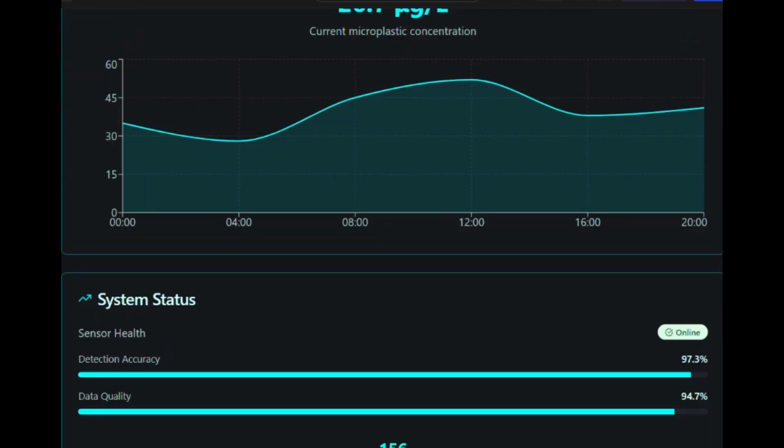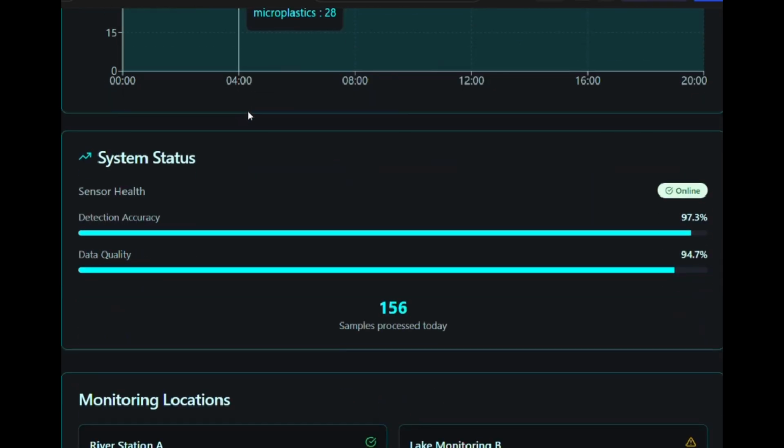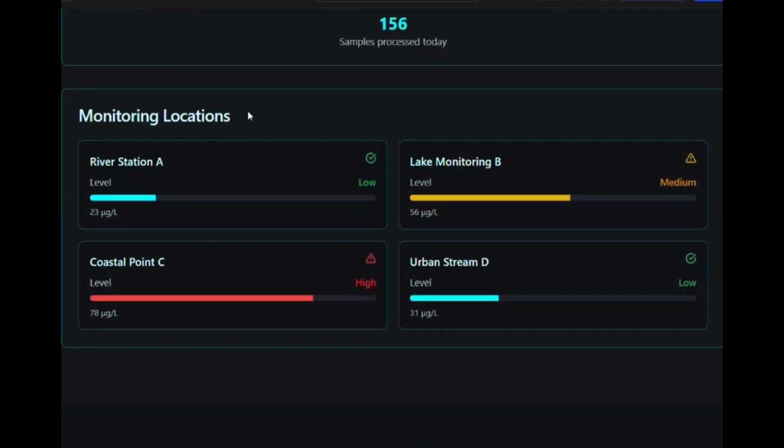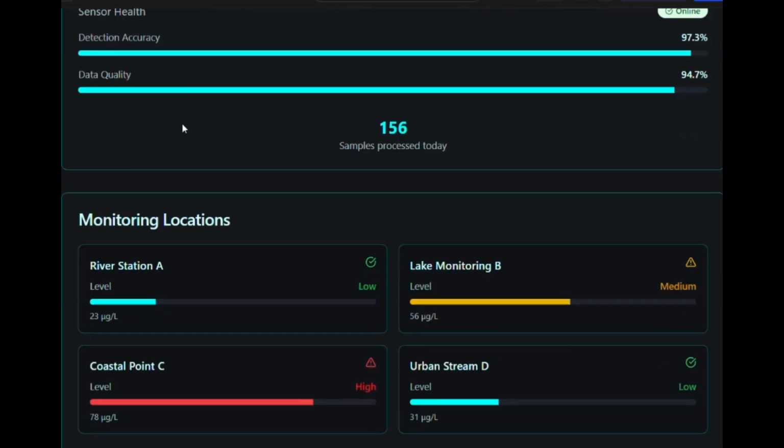The model shows a comparison between the concentration of microplastics in the given sample with similar samples trained and tested on our model, as well as available data resources. We visualize future potential risk on humans and animals on consumption of microplastic contaminated water. For more details, we can add more data and infographic diagrams in this website.